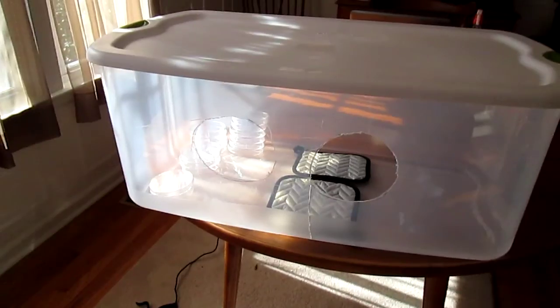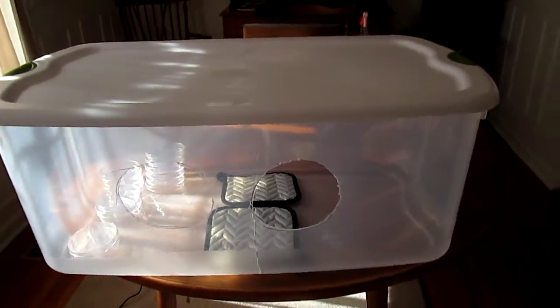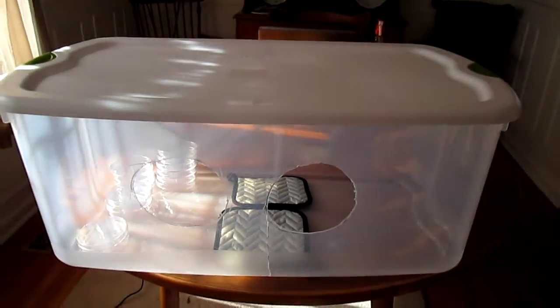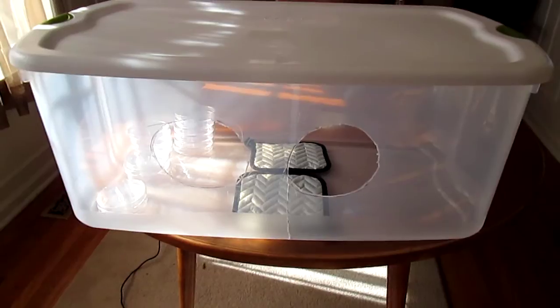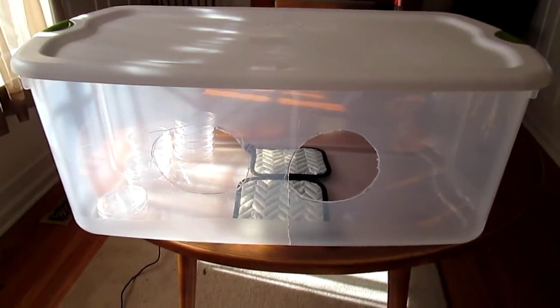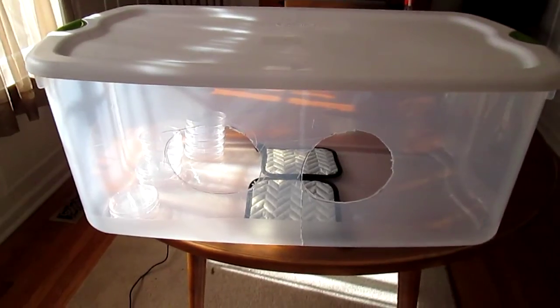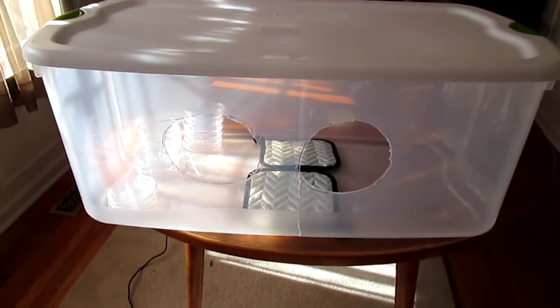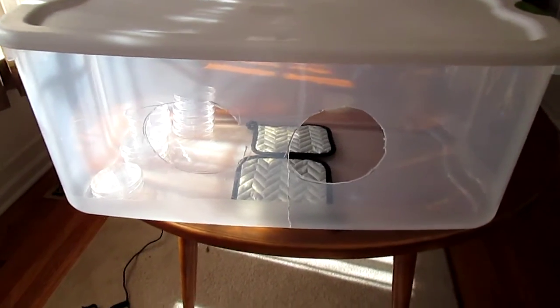I already have my petri dishes stacked up and ready to go inside the box. I'm going to put the camera inside the still air box now and start bringing over my jars. I won't be talking as I'm working because I don't want to introduce any contaminants inside that box — I want to keep everything as still as possible.